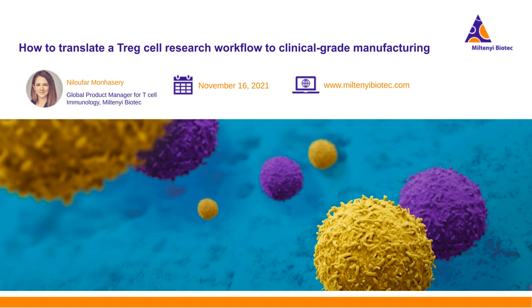So you need to get familiar with analyzing your cells and expanding your cells. For example, expansion of Tregs can be very challenging, so it really helps you to optimize your workflow on a smaller scale. And as soon as you are confident and you have a long-term plan to move to the clinic, you can start to use the clinical products and optimize the clinical workflow as well.